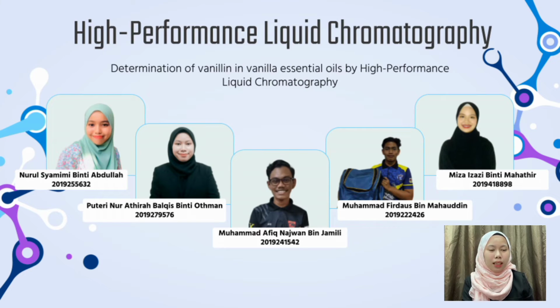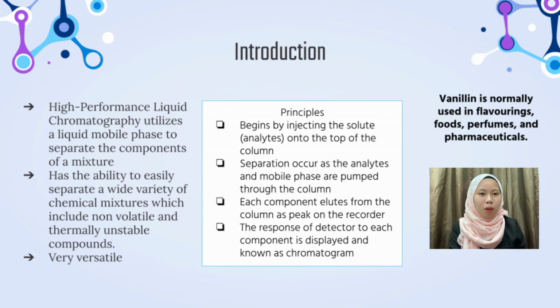Determination of vanillin in vanilla essential oils by high-performance liquid chromatography. I will explain about high-performance liquid chromatography.